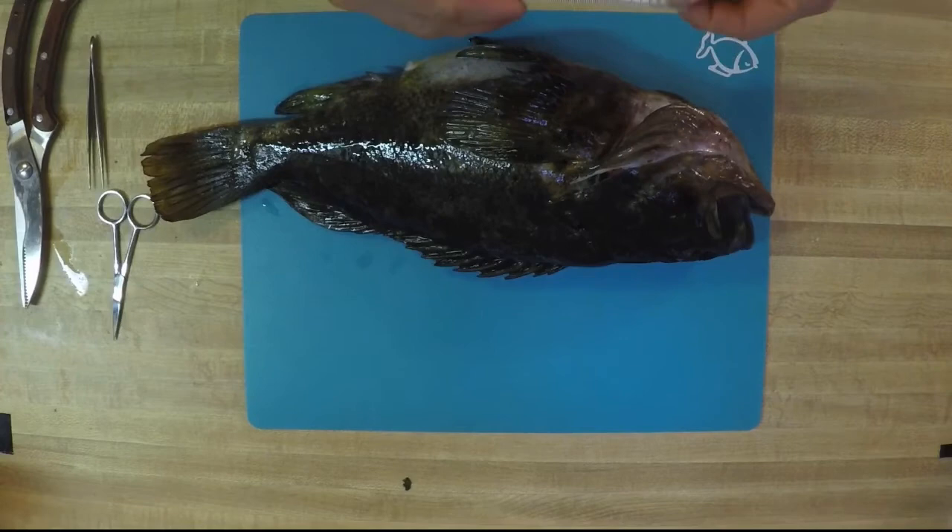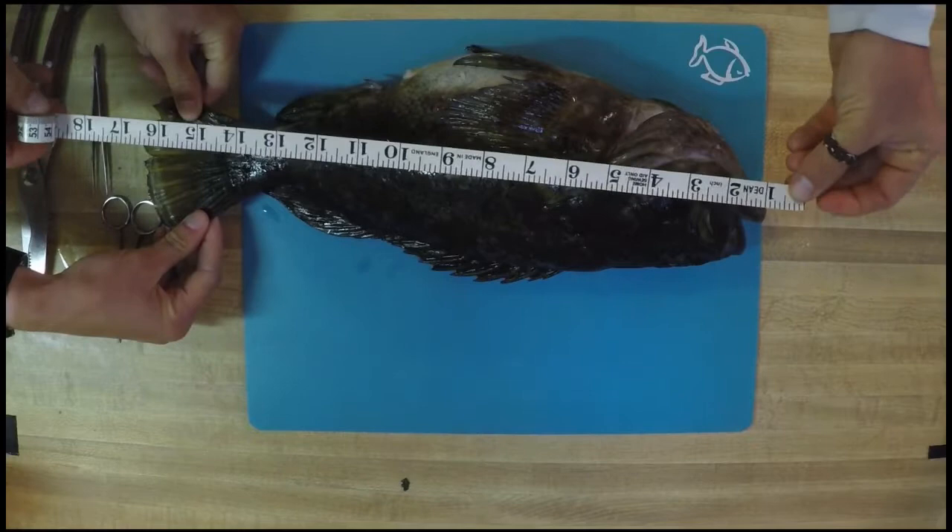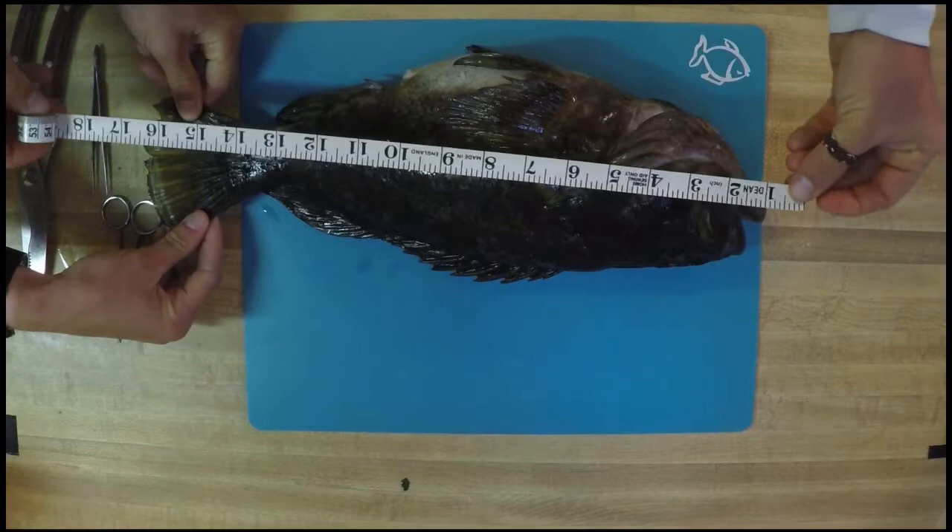The first thing we're going to be using for our tools is our tape measure, and we're going to be going over our different types of measurements for the length of our fish. There are three main ones. The first one is going to be our total length. Total length measures from the very tip to tip of your fish in a straight line — this is known as the straight total length. This fish is currently about 17 inches long. And that is our total length.